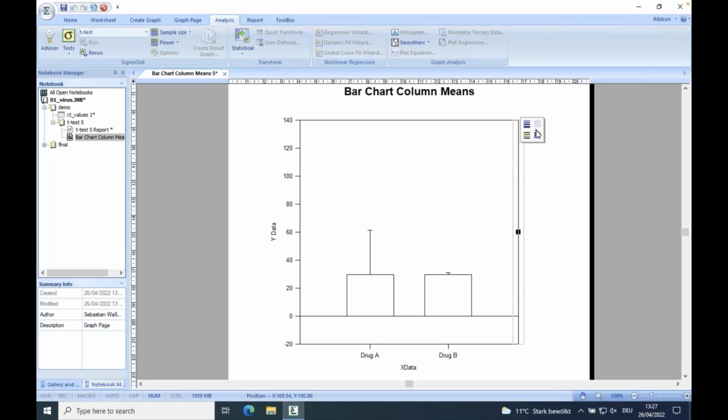You have these mini toolbars here, where you can, for example, choose the color, what kind of axis you want to plot, how big the line should be, what kind of line, for example, not for the border here. And you can adjust it right away.